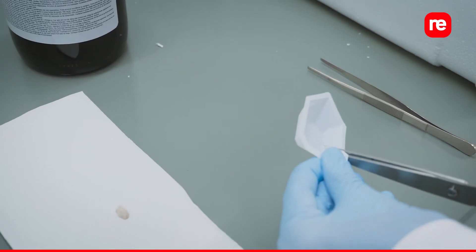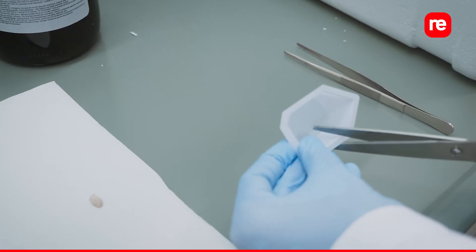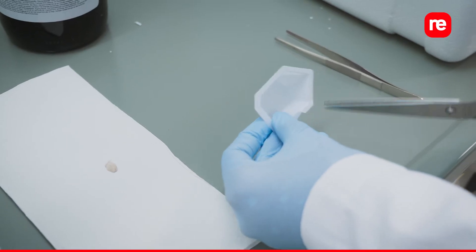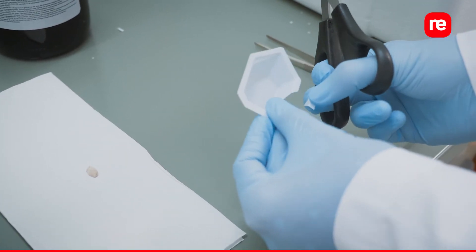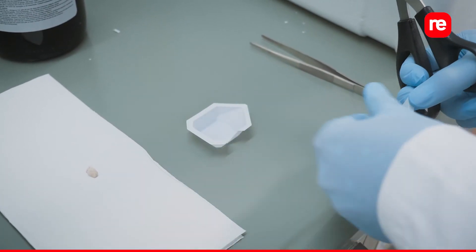A great trick is to use a weighing tray to make it easy to retrieve the tissue. First make a small snippet in the tray using scissors, which will help to decant the isopentane.